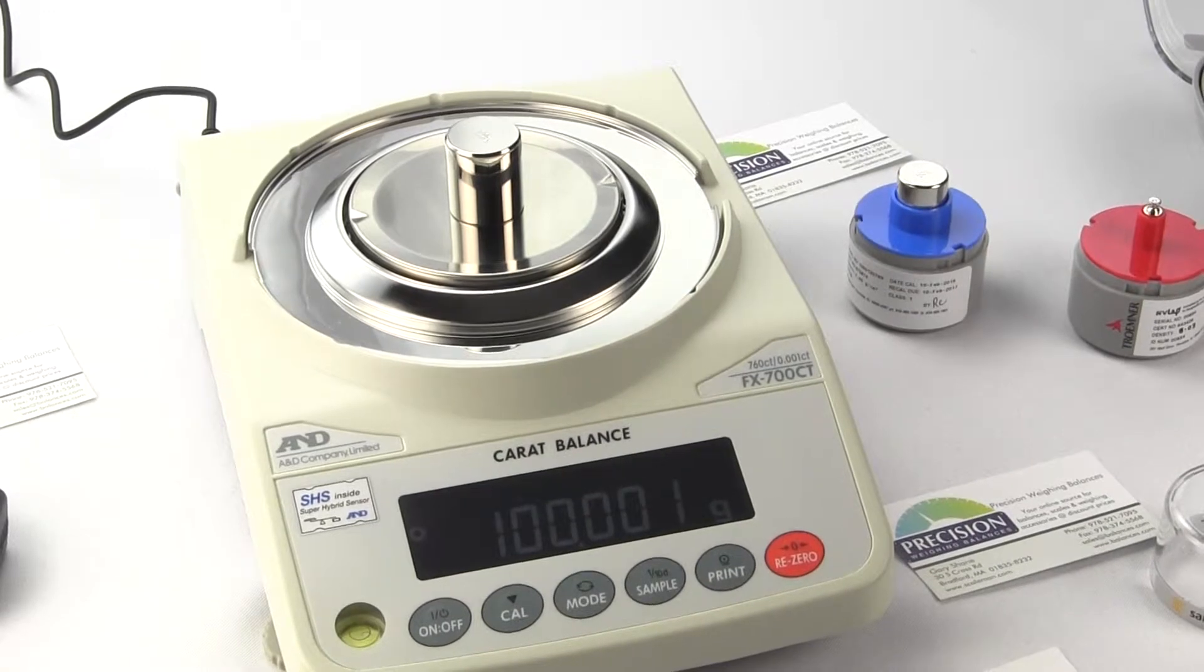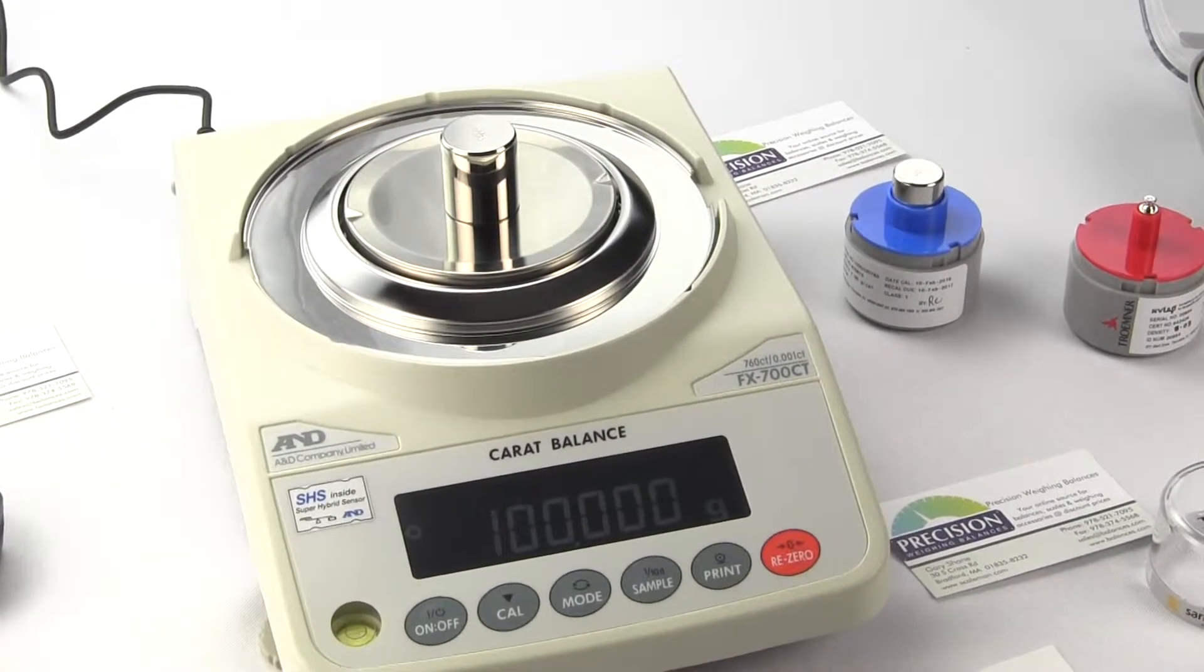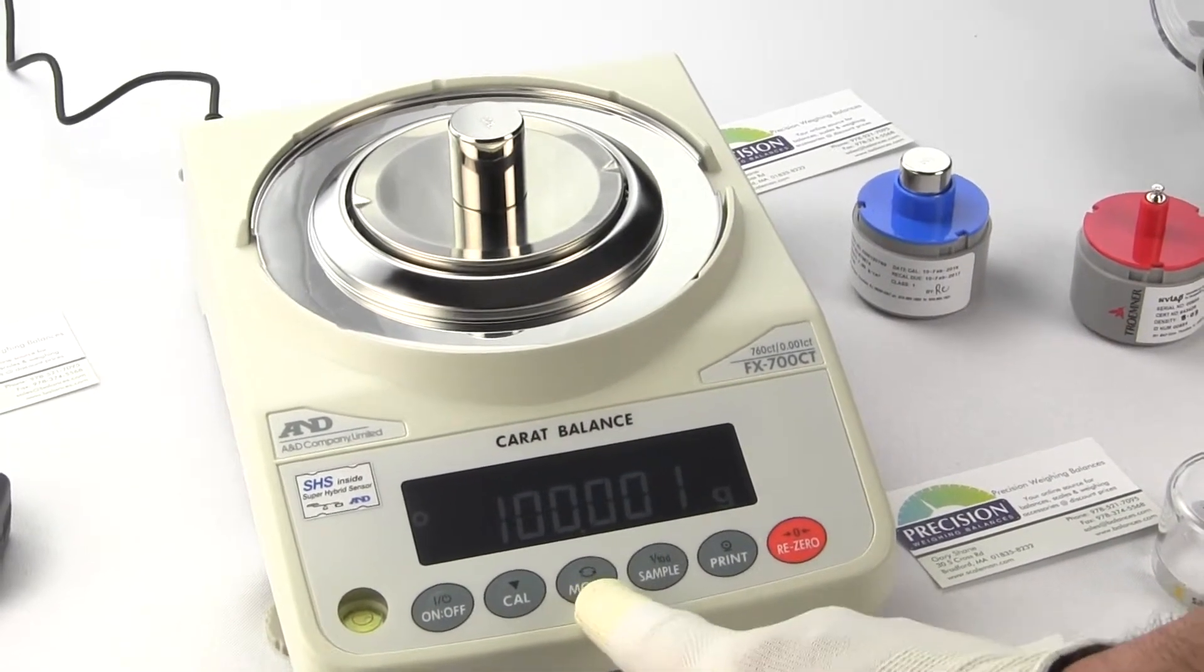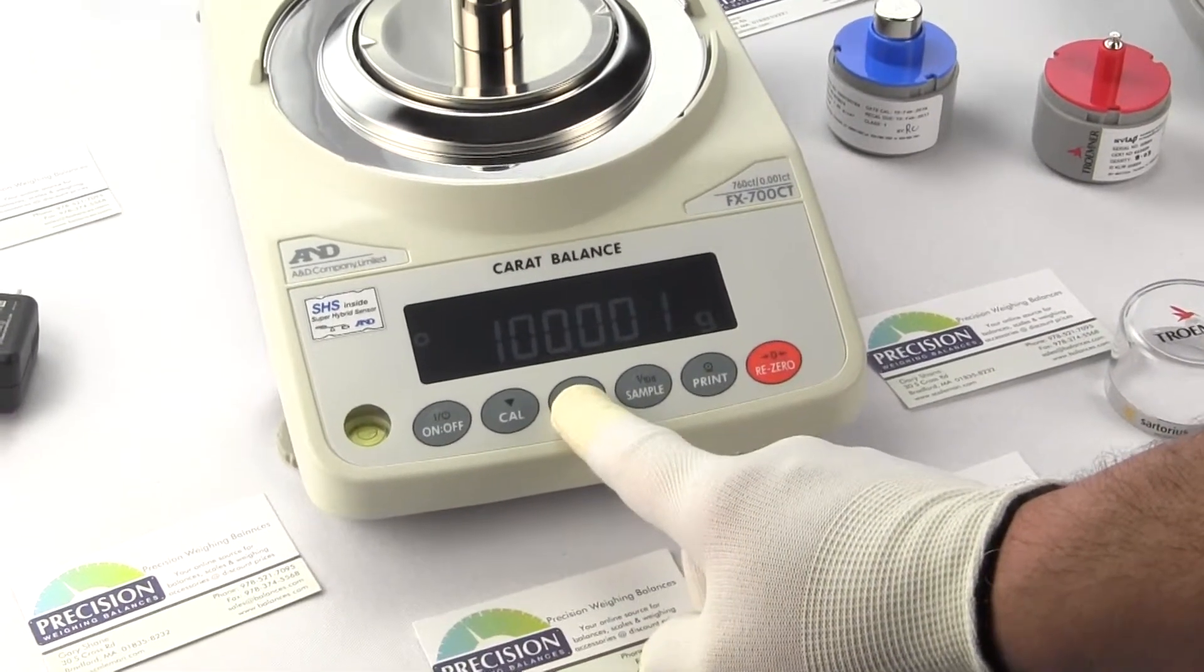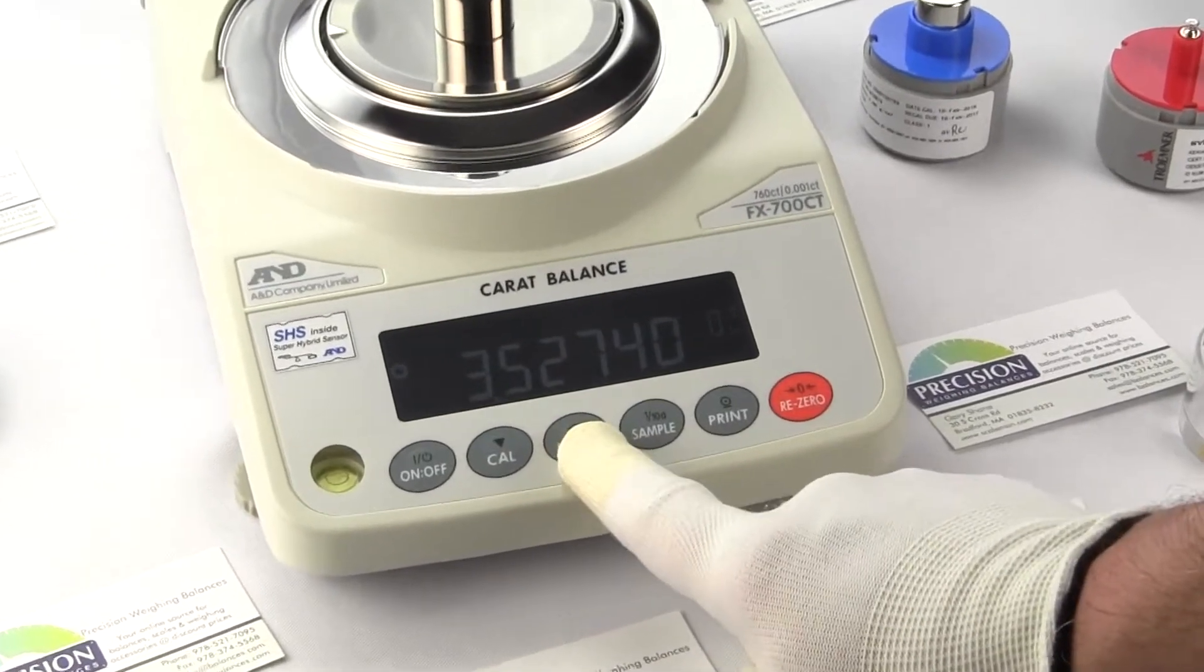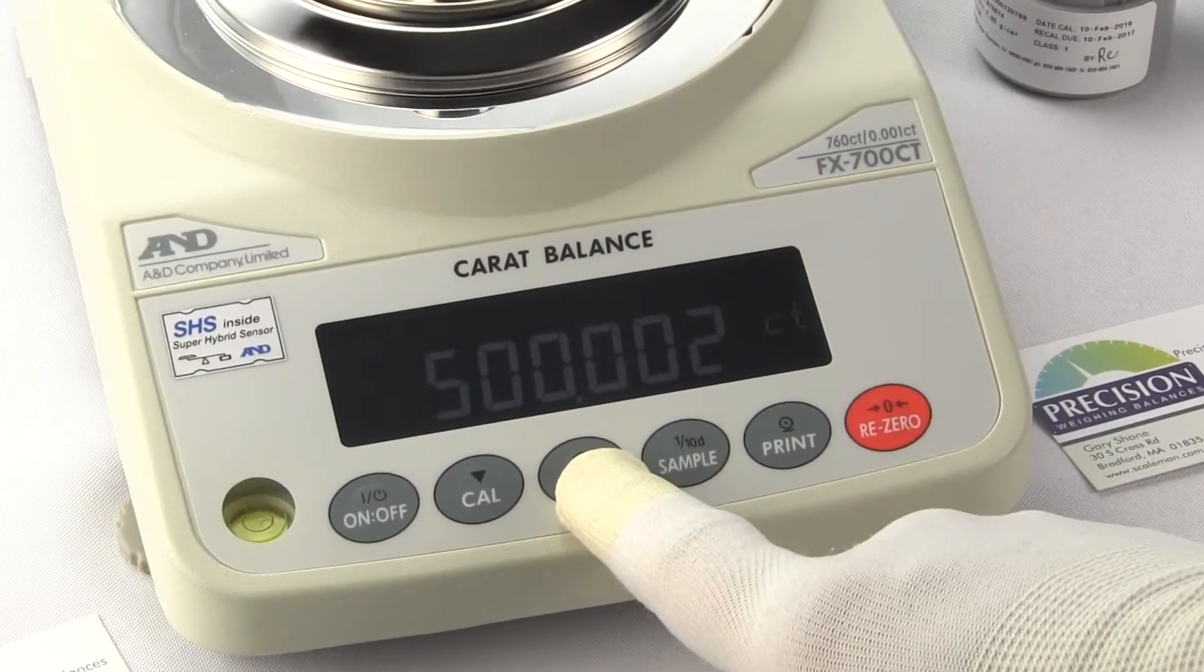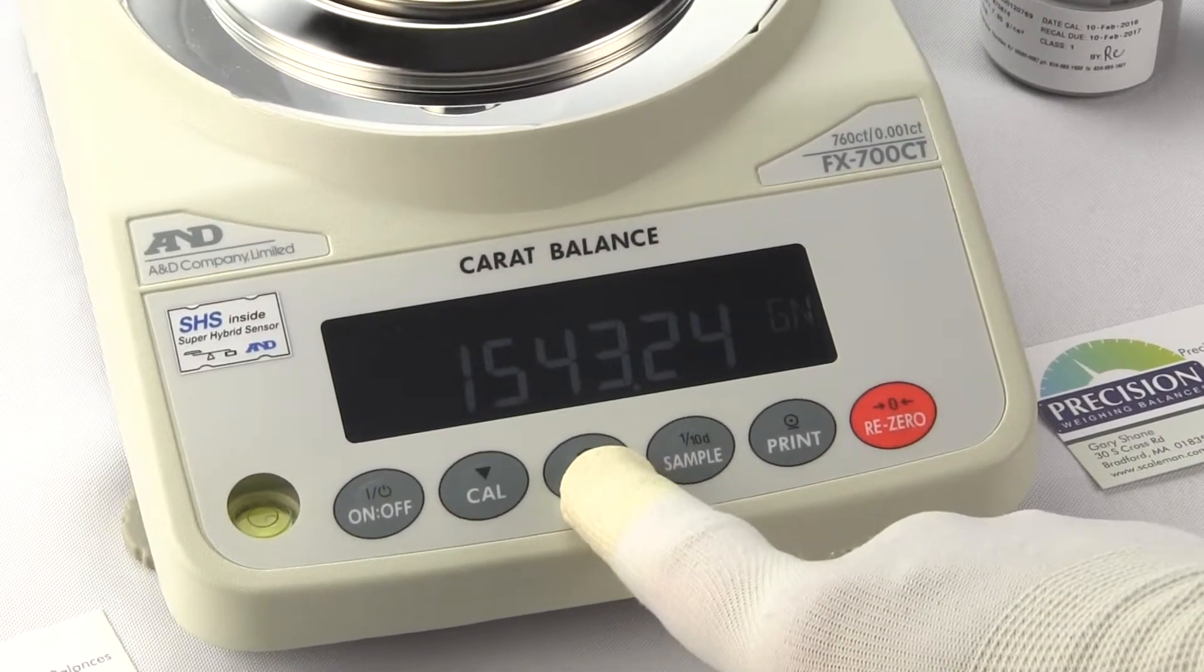The FX700CT out of the box weighs in carats and grams. The balance does feature multiple weigh modes. So if we press the mode button I've configured the balance for multiple units. So we have ounces, pounds, troy ounces, carats, pennyweight, grains.